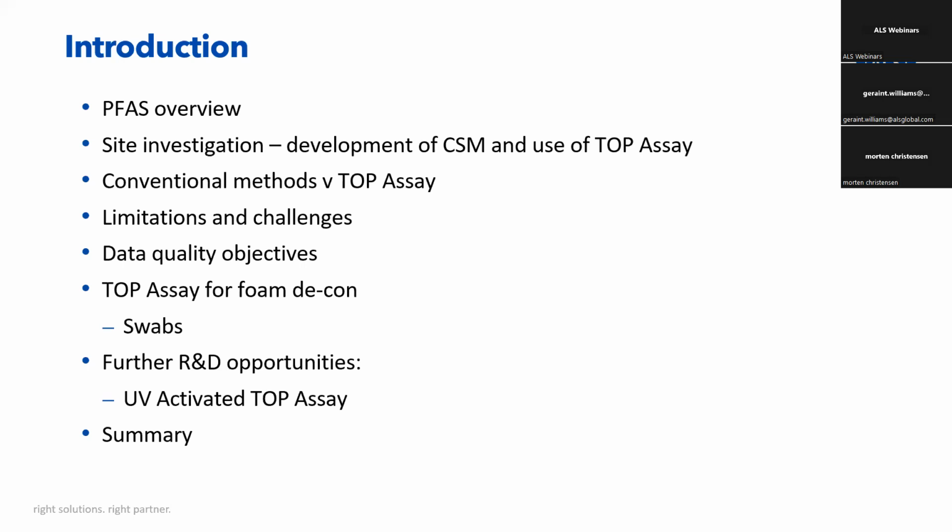But we're going to look at some of the limitations and some of the challenges. We're going to have at least a couple of slides on the data quality objectives. I wanted to talk a little bit about a niche use of TOP assay as well. We've seen it being used for foam decontamination work, which I know there's a growing interest in the US for, as we're moving away from PFAS-containing foams, or AFFF, and using fluorine-free foams.